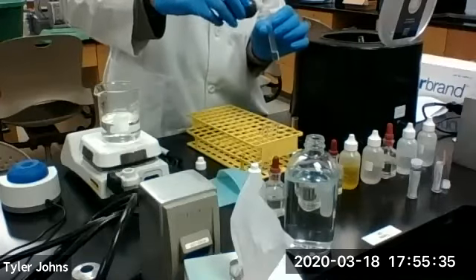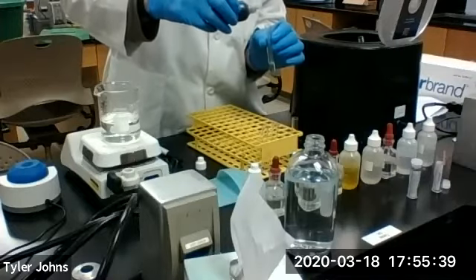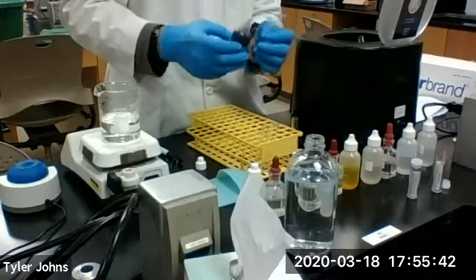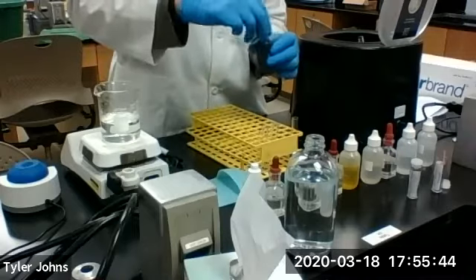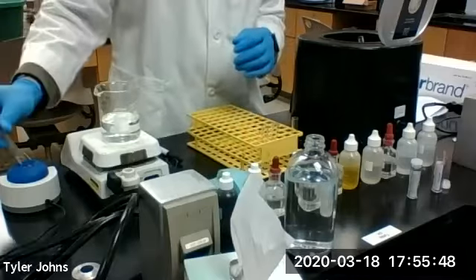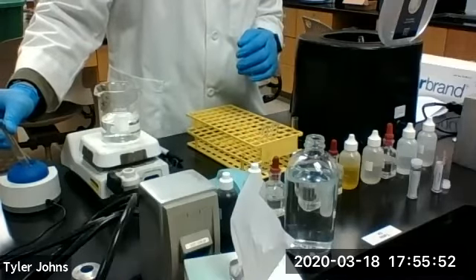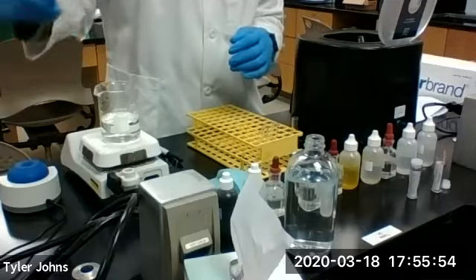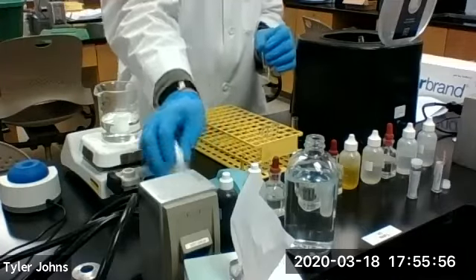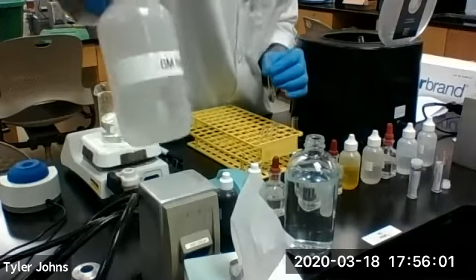One drop of this. Now we will be making our solution alkaline with 6 molar sodium hydroxide.